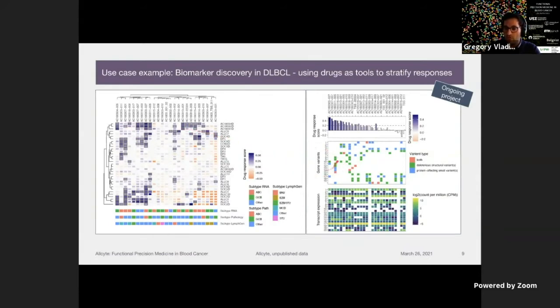And we can say, okay, do I see patterns of the gene variants, expressed gene variants, ranking the patients by the drug response score as in the EXALT trial, and saying, here's my responding, here's my non-responding group, and do we see these gene variants? Because the genetic biomarker or the genetic point of care is still quite popular, obviously, in the clinic.